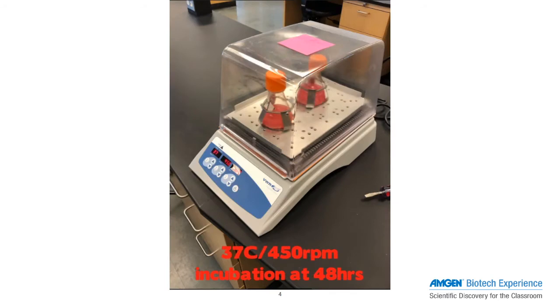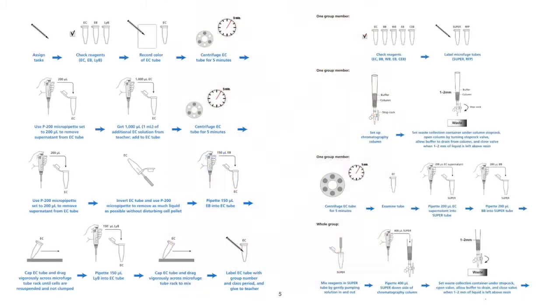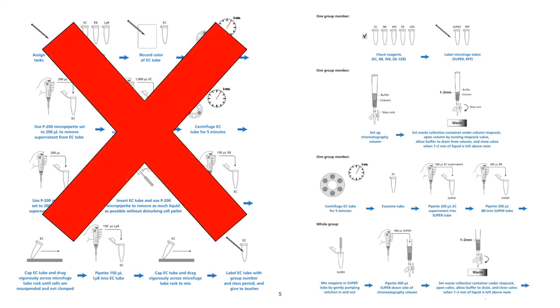Your ABE site may have backup cultures should you run into issues with growing your pink culture, be it white, orange, or blush. These may be in the form of a dense, transformed E. coli cell culture that you can use to try and grow your cell culture again. Alternatively, your site may be able to provide prepared E. coli lysates that students can use to skip all the steps in Lab 6A, starting directly from the column setup and spin steps at the start of the Lab 6B flowchart.